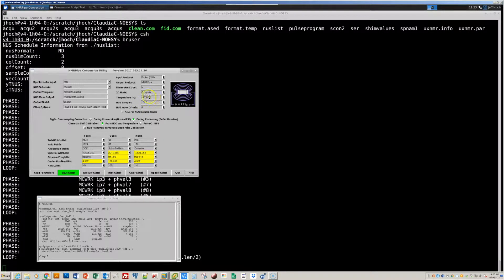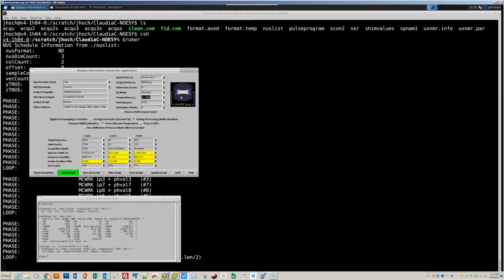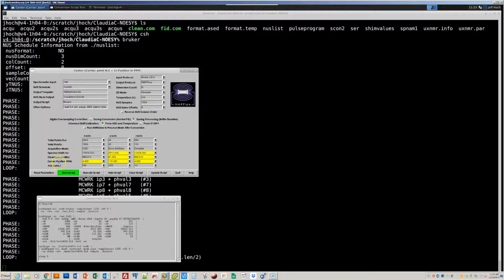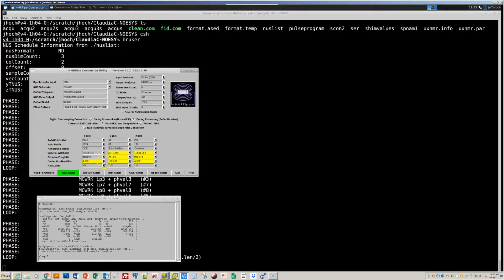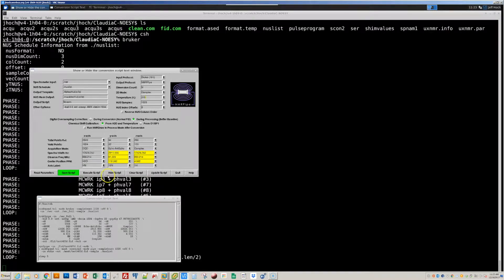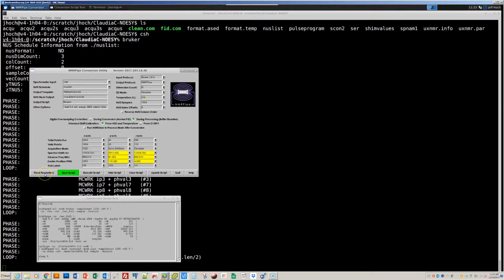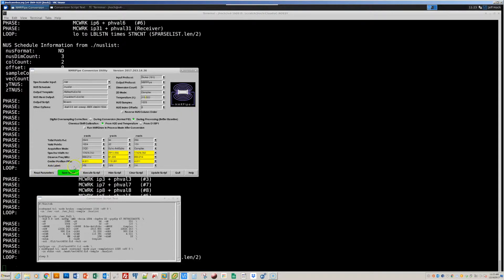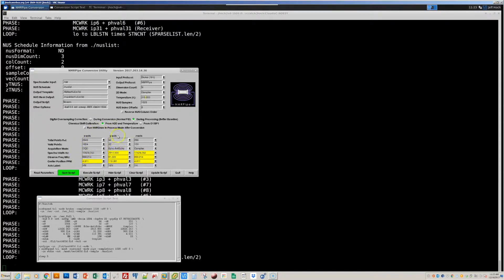So in these cases, I can type in temperature manually, set the center position in ppm to h2o, the way it was when we started the interface, and then I'll read the parameters a second time. And that will calculate a new chemical shift at the temperature that we entered manually. And that chemical shift calibration will be propagated to the other dimensions.